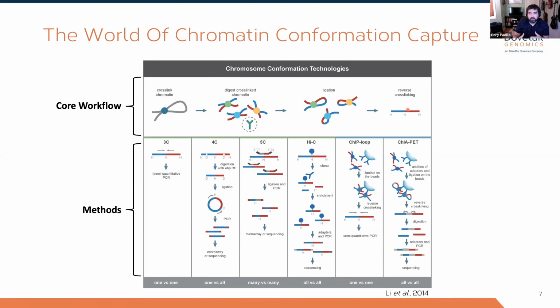If you think back to mate pair libraries, how they make circles and the size of that circle, and so the tag at either end of that biotin is representative of like 4 kb or 10 kb, it's kind of the same idea, but just kind of on steroids, where we're capturing all of those three-dimensional events through that chimeric molecule generation. Now, once you have this chimeric DNA, there are many things that you can do with it.